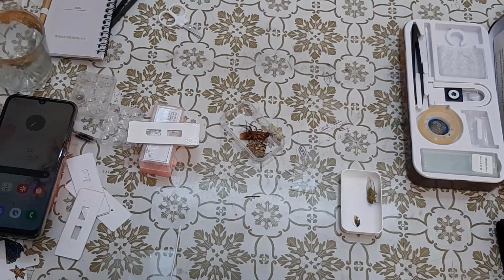I guess this one will not look very clear under the Foldscope because it's kind of thick. Yeah, we need to make it layer by layer. Let's try it with the light source. Yeah, as you see, when we have a strong light source, more details we can see.